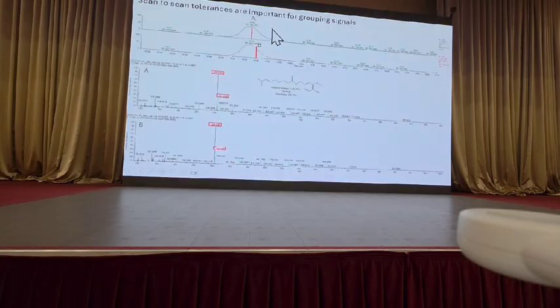So we're able to get not only the peak of a specific metabolite, but we also get the peak for the isotope, the C13. Intrasample retention time tolerance is how much the retention time shifts between the two isotopic signals within the same sample.